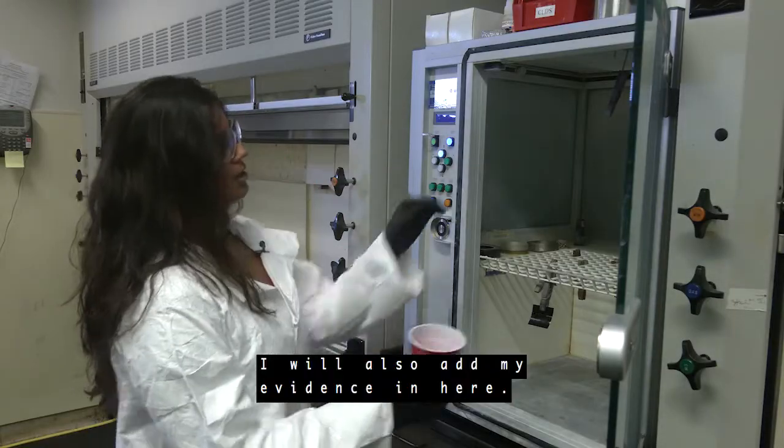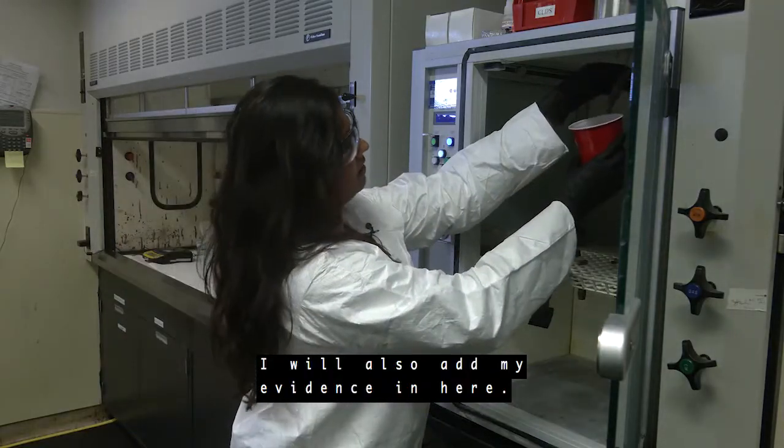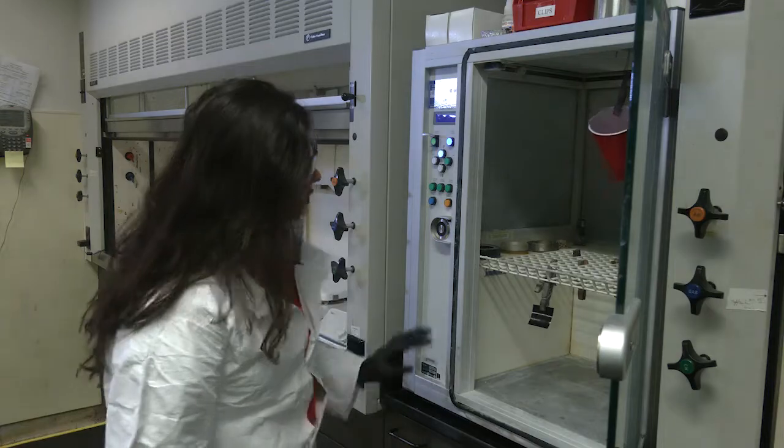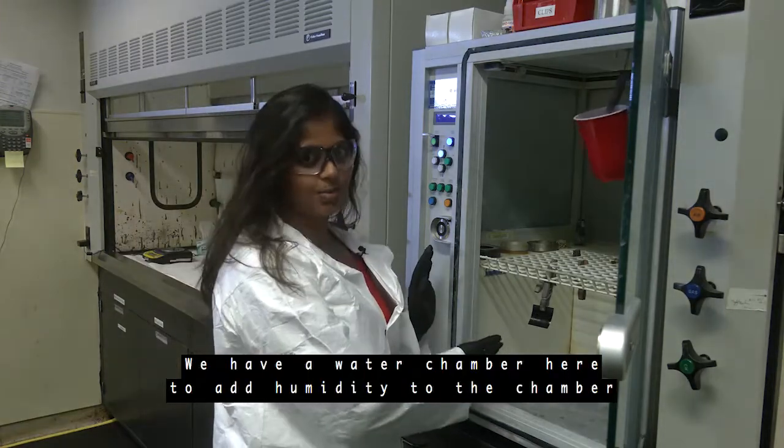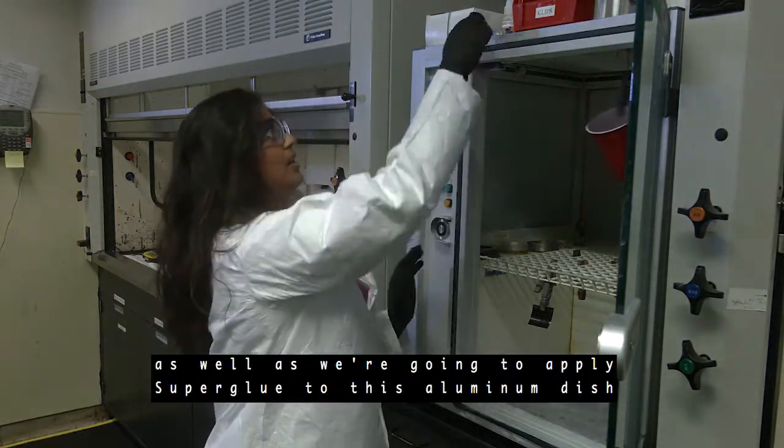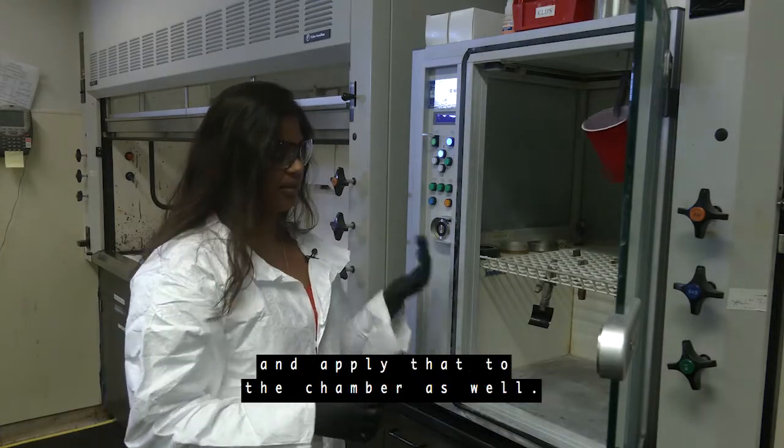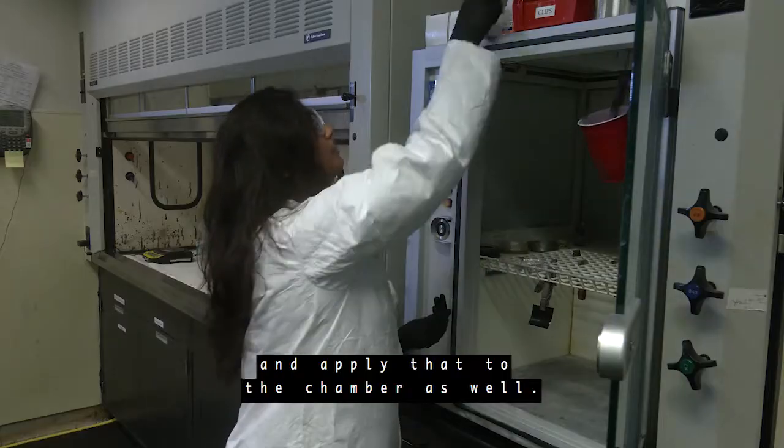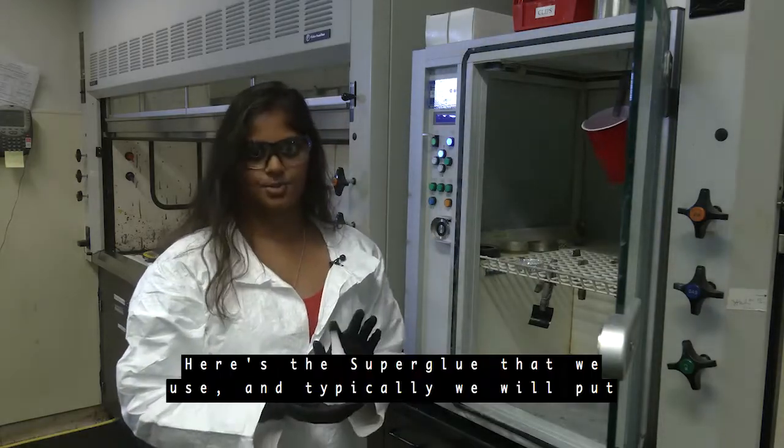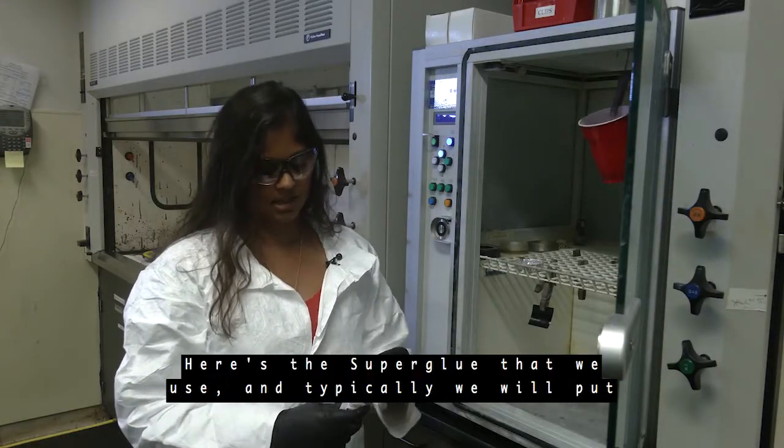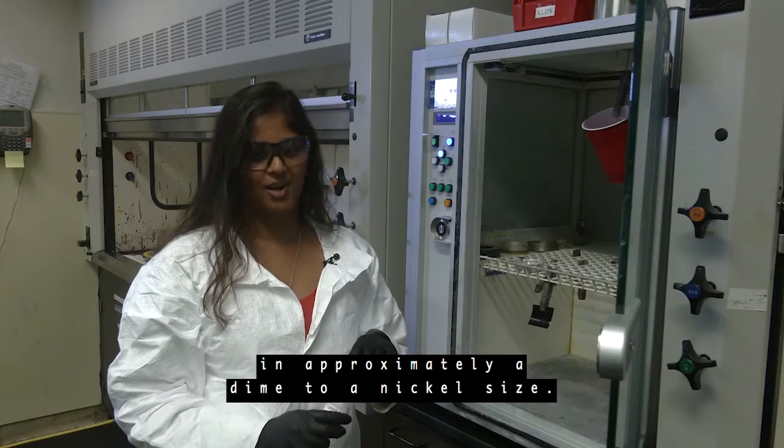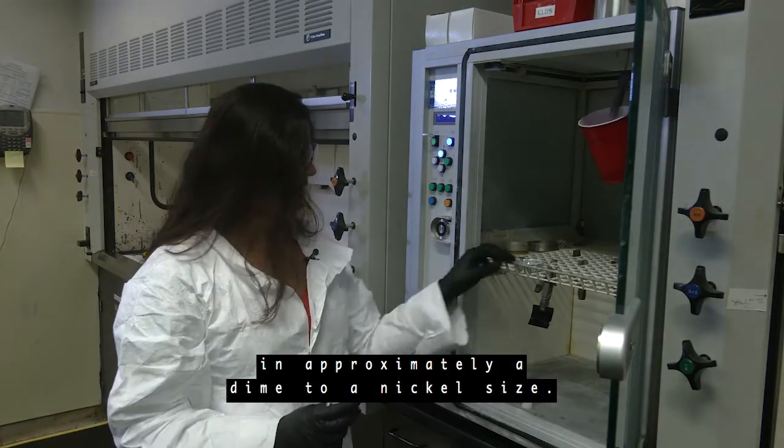I will also add my evidence in here. We have a water chamber here to add humidity to the chamber as well as we're going to apply superglue to this aluminum dish and apply that to the chamber as well. Here's the superglue that we use and typically we will put in approximately a dime to a nickel size.